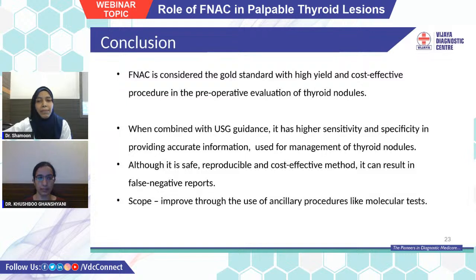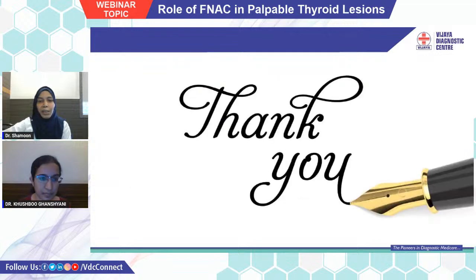Although it is a safe, reproducible, and cost-effective method, it can result in false negative reports sometimes. So, in future, we have a scope of improving the diagnosis of thyroid lesions using FNA and ancillary tests. That's what we had to say. We are open for questions, if any.